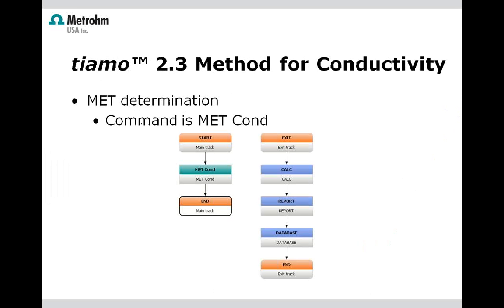And this is just an example of how simple a conductivity titration is. This is one of the programs we write. It's just a simple flow chart. You just have your titration and calculation. There's usually for conductivity titrations no special extra reagents you're going to add. They're very rapid, very smooth, very easy. Nothing much fancy going on, which makes it also attractive to a lot of people because, of course, the more robust, the fewer parameters that you need for something, typically the better it is to use.